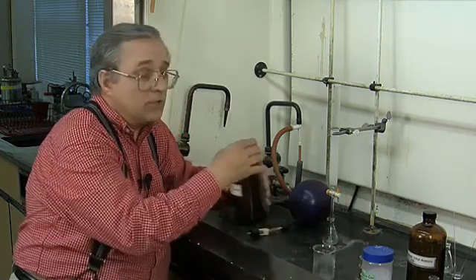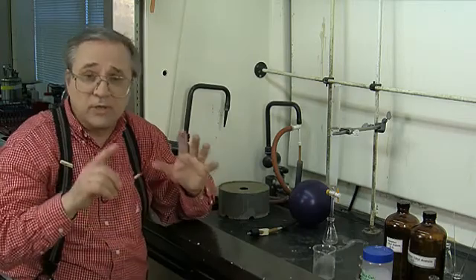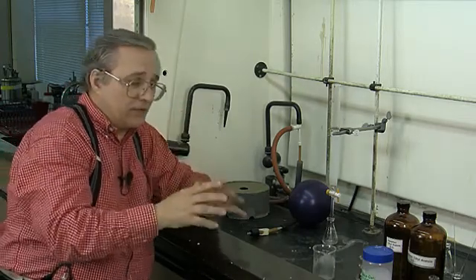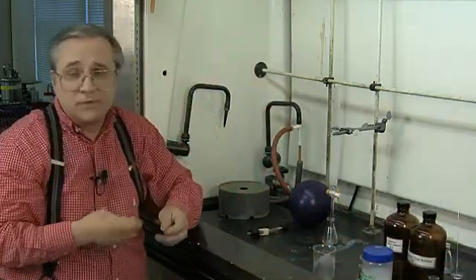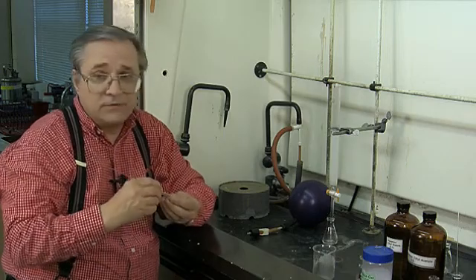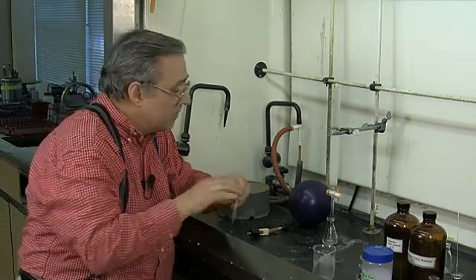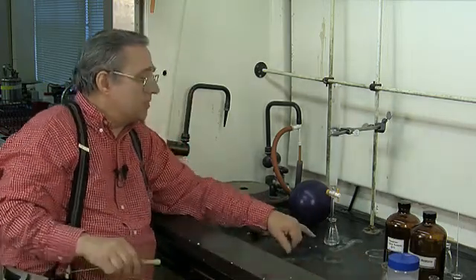This process is called loading the column, and we want to load it carefully because this is where the separation will be most effective. If we do a sloppy job of loading the column, we're going to get poor separation of the components in the mixture.